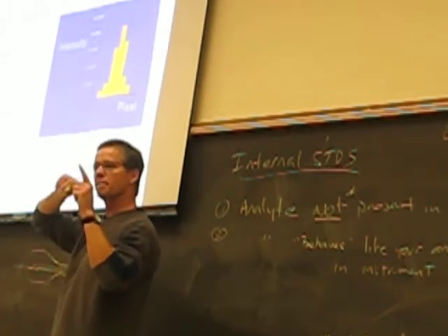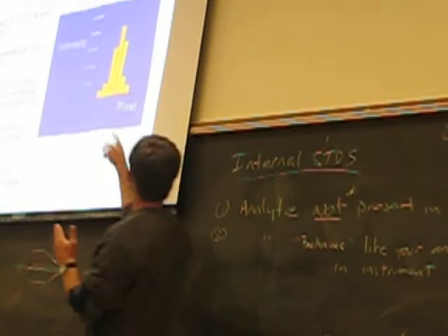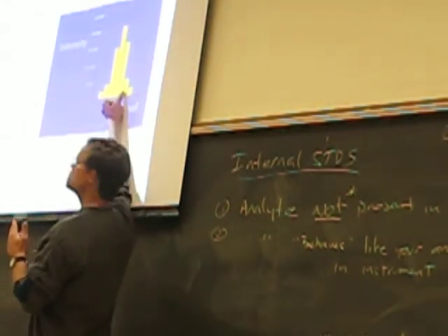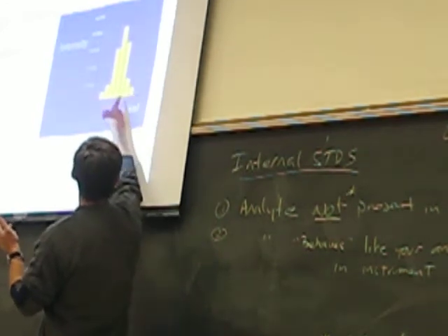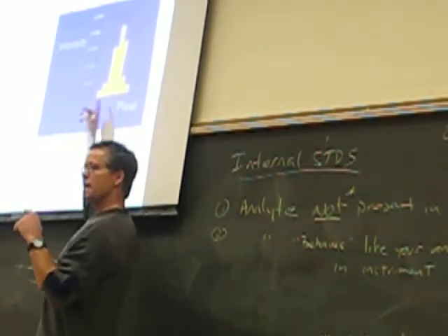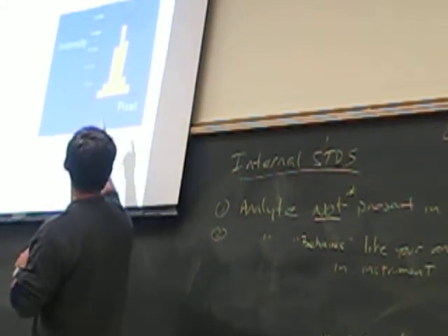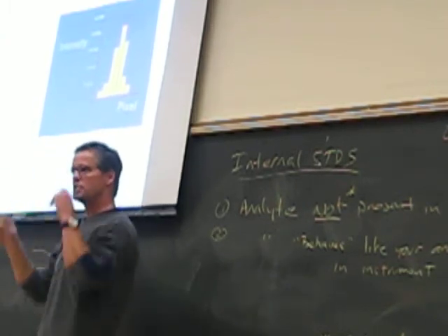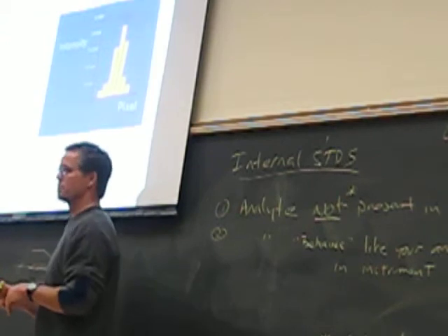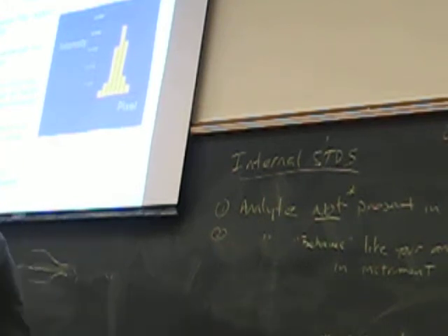So at one selected wavelength of, say, 490.033, you would get a distribution of the emission photons coming from your analyte along those pixels of the detector. It would give you, ideally, a Gaussian distribution, which is what you'd expect, like this. So it allows you then to select and minimize any potential slight overlap you may have with adjacent emission lines by doing that. Which is very, very effective. And you can measure things across an enormous range of wavelengths, unlike what you see in UV.